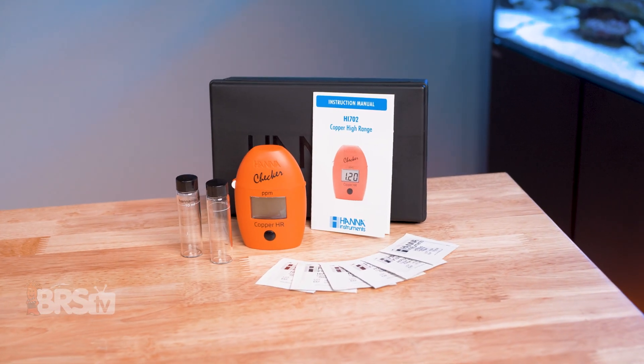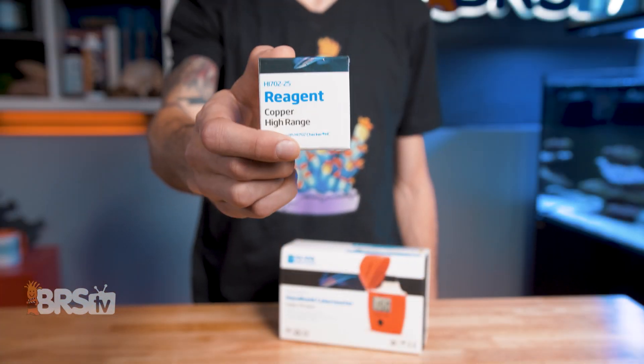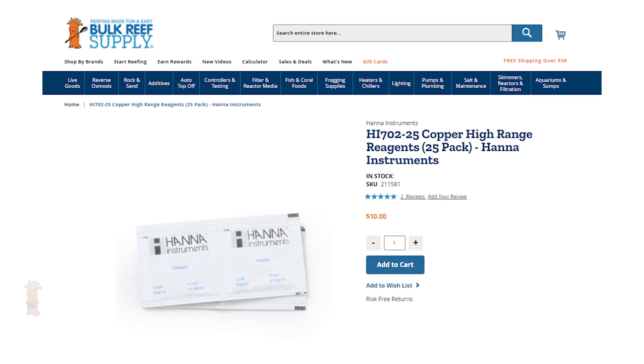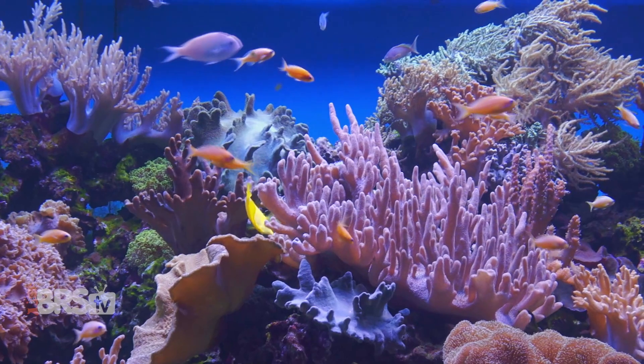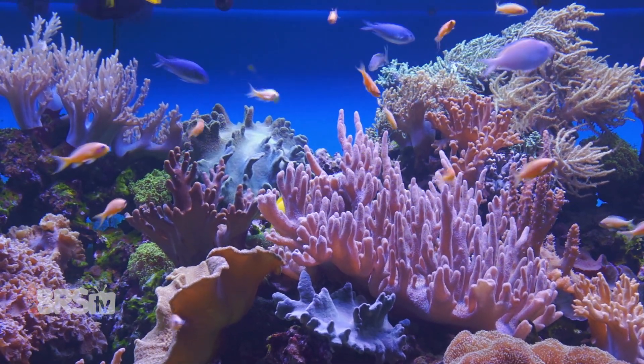Like I mentioned, the checker does come with six packs of reagents, which will work out to six tests, but you'll most likely want to pick up an extra pack of reagents along with the checker. A pack of reagents provides 25 tests and will work out to roughly 40 cents per test — well worth it to make sure your copper treatments are effective and your fish are healthy and parasite free.